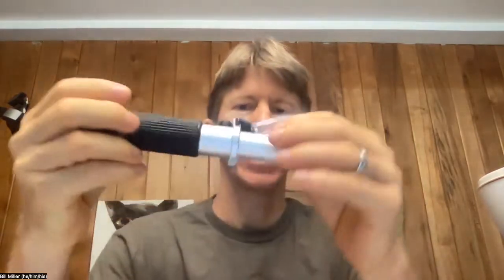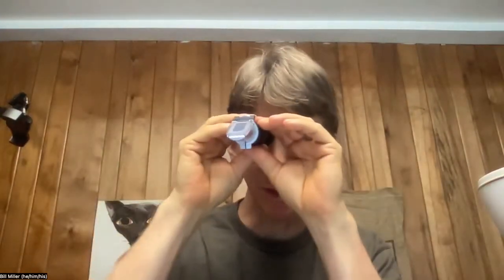This is going to be calibrating the handheld refractometer. First off, take out your handheld refractometer. You've got its cover piece, it's got its prism, and it's got its eyepiece that you'll be looking through.